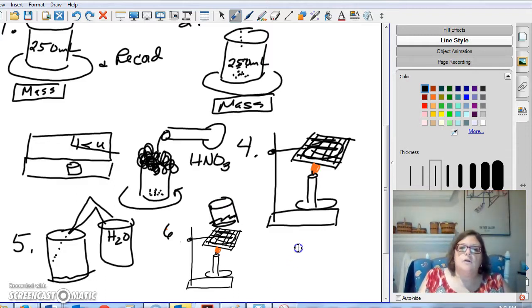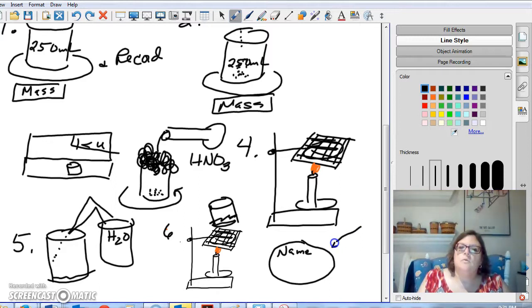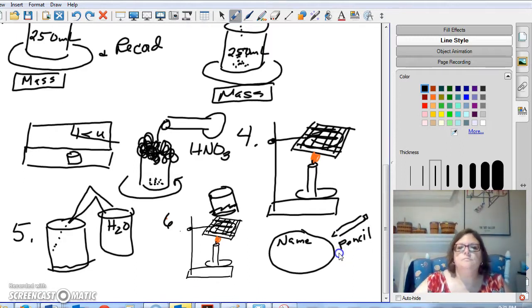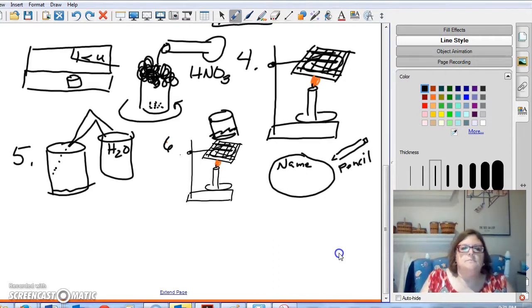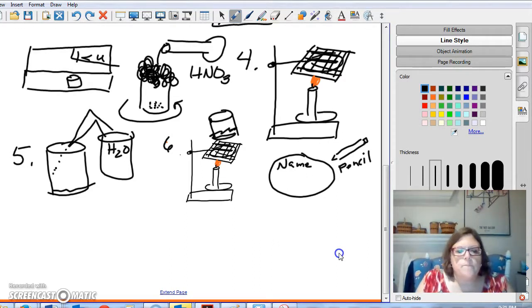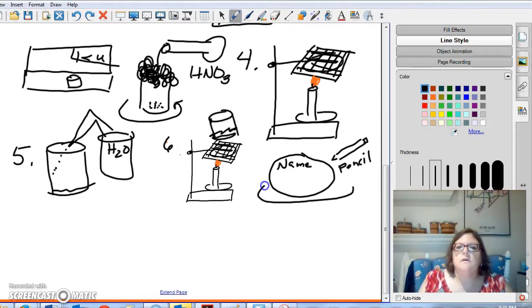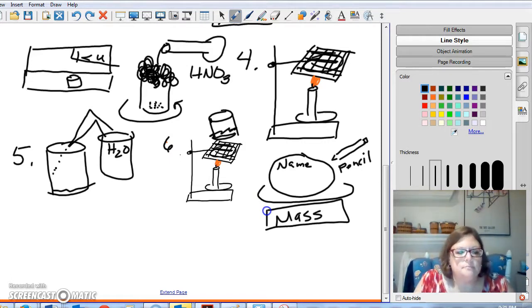Now, while that's going on, you're going to get a piece of filter paper. And you're going to write your name on it in pencil. Write it at the edge. Okay. Then, you're going to find the mass of that filter paper. And you're going to record it.